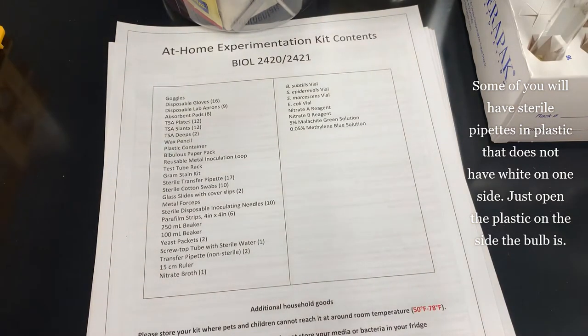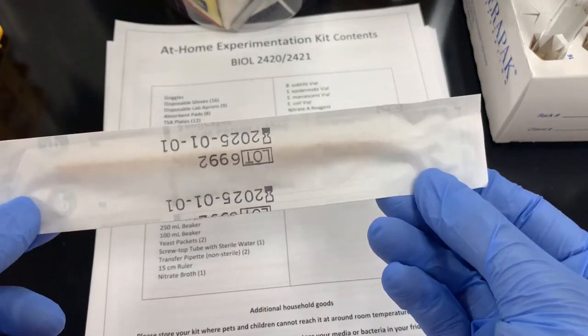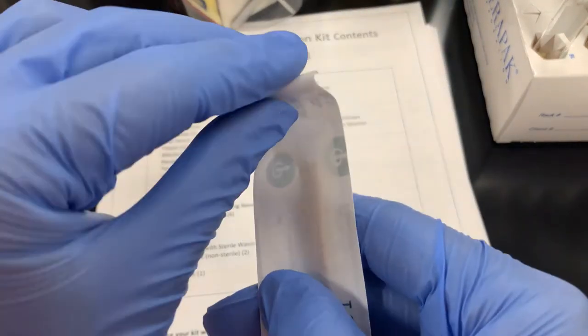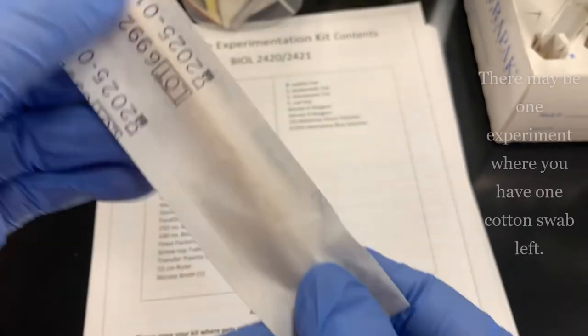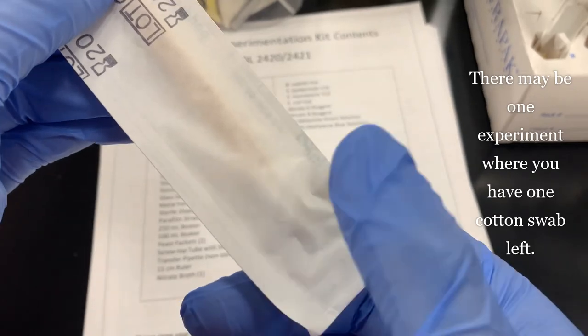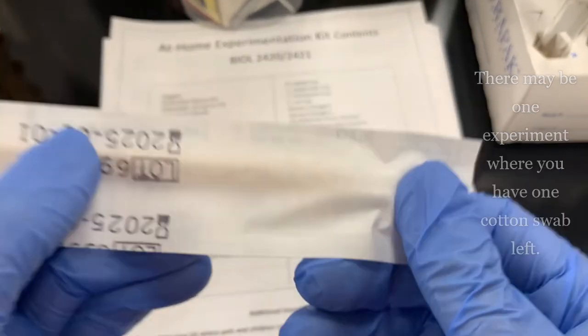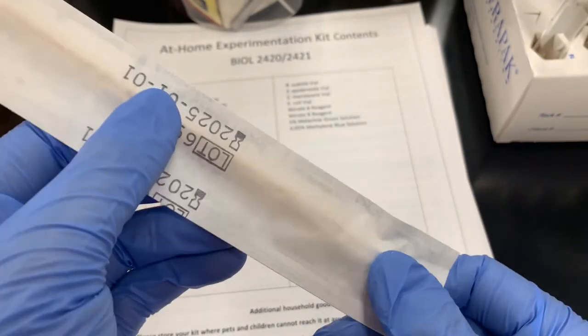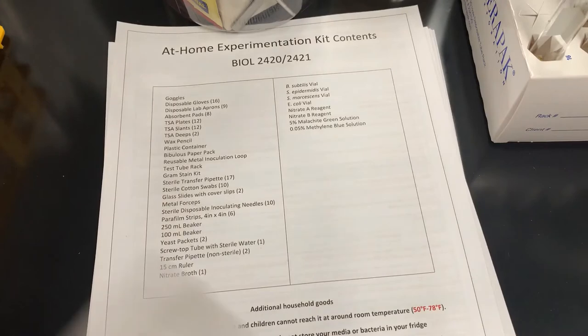Next, we have sterile cotton swabs. Now, you get 10 of them, but really you get 20 because in each one is two cotton swabs. Same thing with the tab up here. You can pull that apart when you use them. You're gonna pull out one stick at a time. I repeat, just one stick at a time. You want the cotton part down here to remain sterile for as long as possible, and you're going to use both, okay? You're not gonna have any extras of this. Make sure that you only pull out one at a time to use.